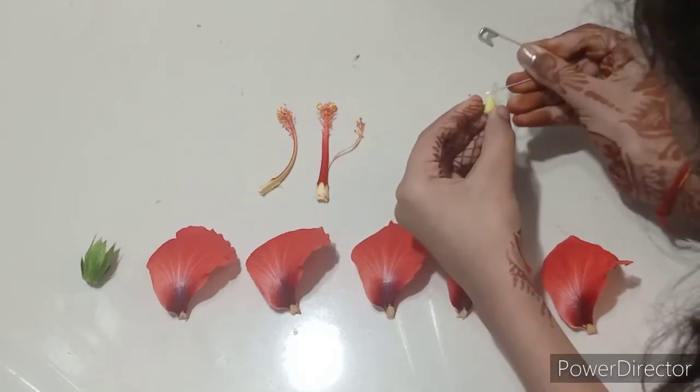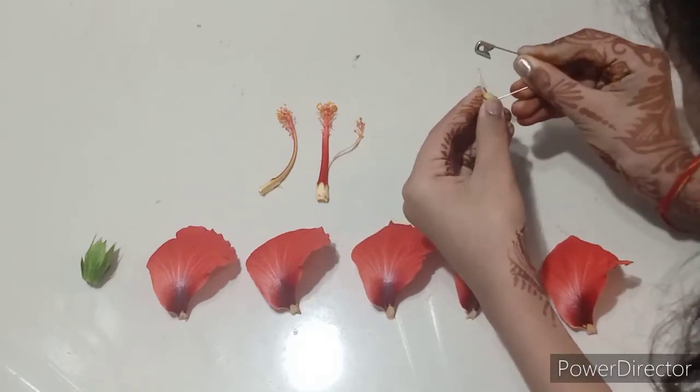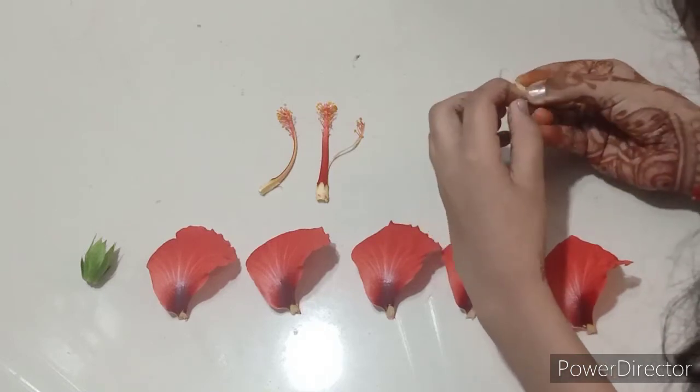Now for the ovary, I have created a small slit and I'm opening it up like this.